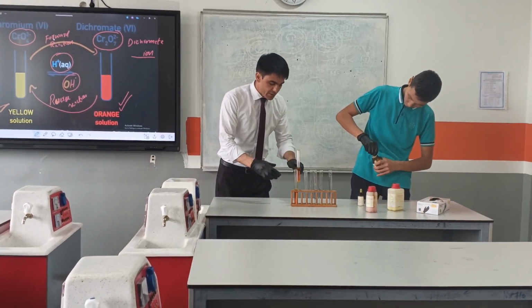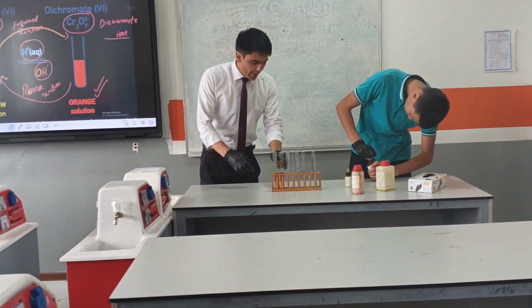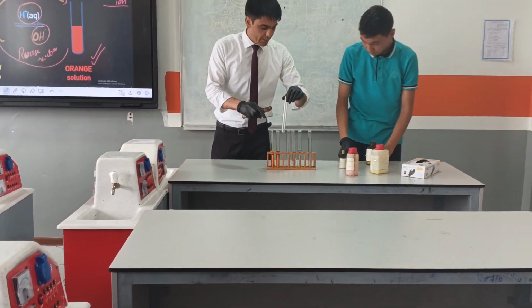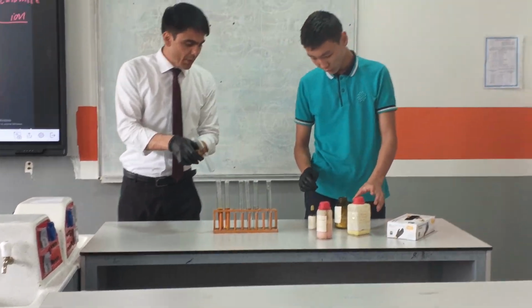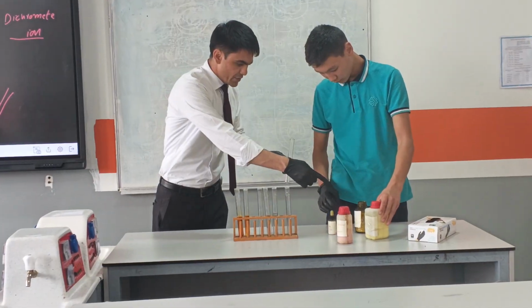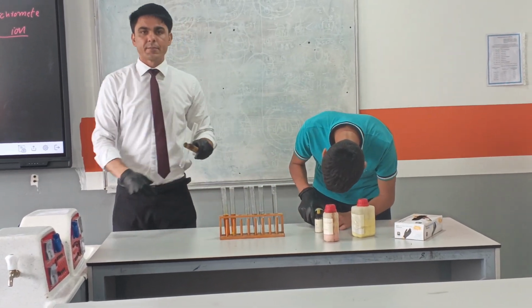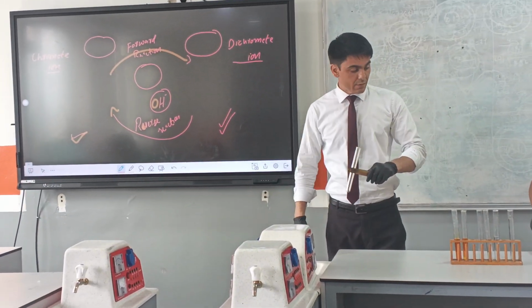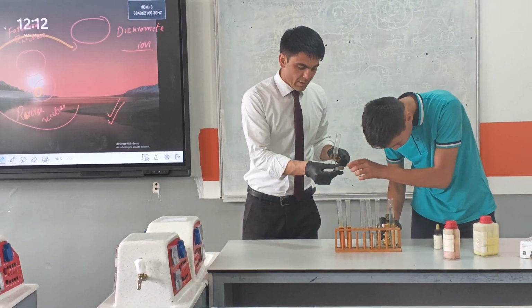And for sodium hydroxide, we will again make a solution. A little amount, just add here. So you will see which reaction, reverse.